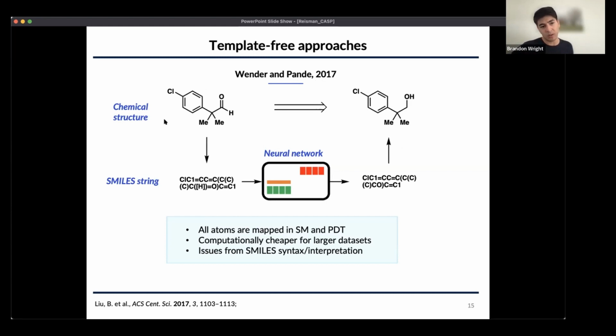And what they did is they said, well, if we can convert our chemical structures to something called a SMILES string, which is kind of like a SMARTS string, but is essentially just converting this into one-dimensional text. And in theory, you can translate text back to structure seamlessly. And they thought, let's train a neural network to translate, in a retrosynthetic sense, products to reactants. And we're not going to teach it anything about what an oxidation is. It doesn't know what atoms are. It's just going to try to translate like English to French, for example. That's the analogy. And so that's the approach.